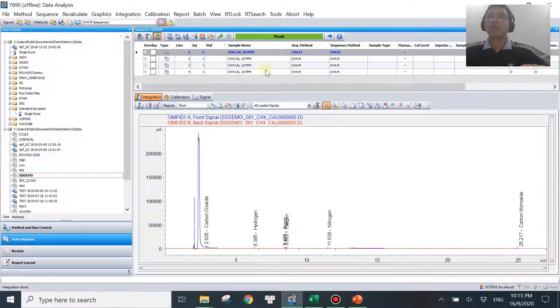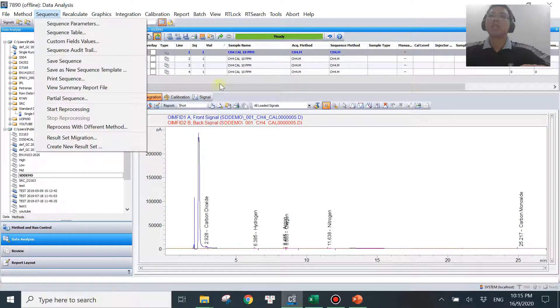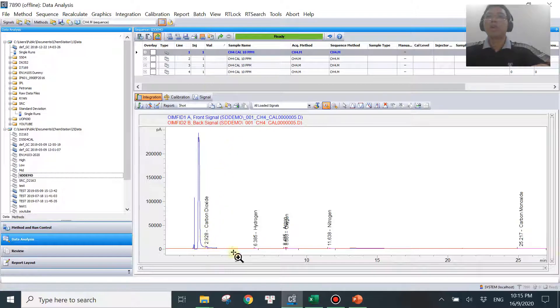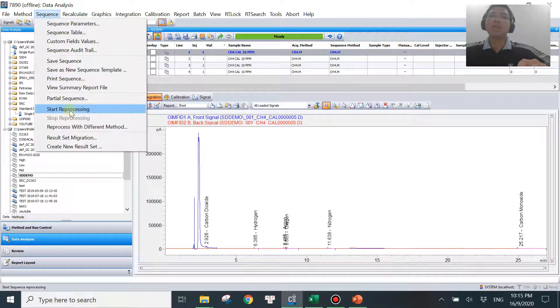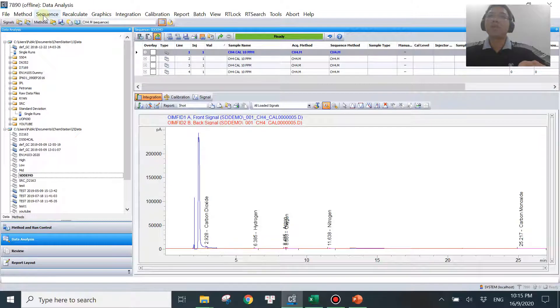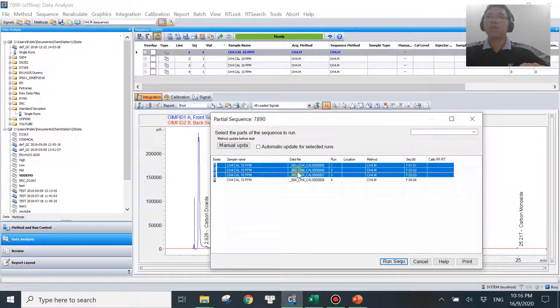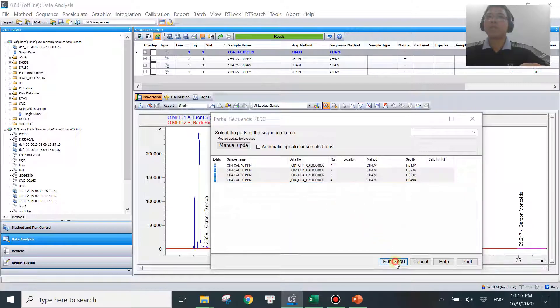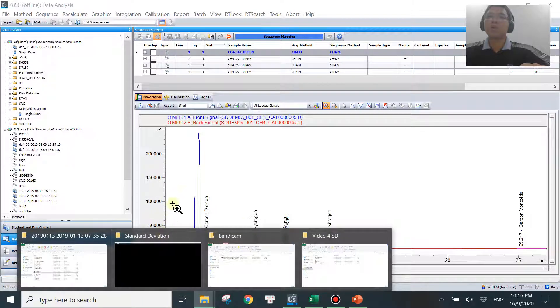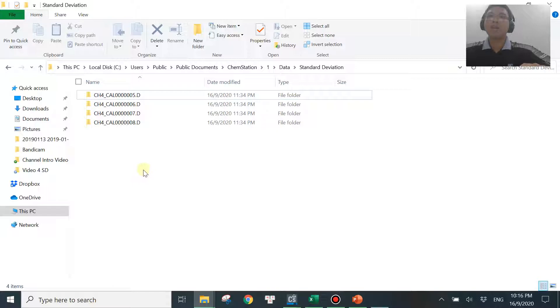Because they are now in something like a sequence, the sequence button will be available. Go to Sequence and you'll see all the options. It's the same steps as before — go through every program, make sure you're happy with the iterations, make adjustments if needed. Then either go to Sequence and hit Start Processing to process all of them, or go to Sequence and Partial Sequence to select which ones you want. I'll process the last three. Hit Run Sequence, then go to the folder that contains the data and wait for the PDF to be created.